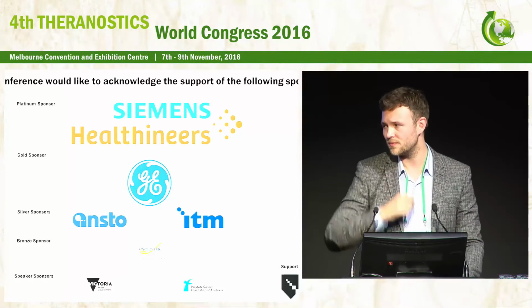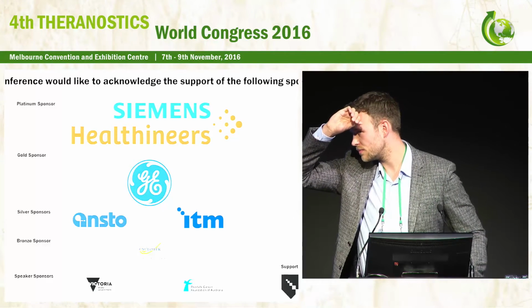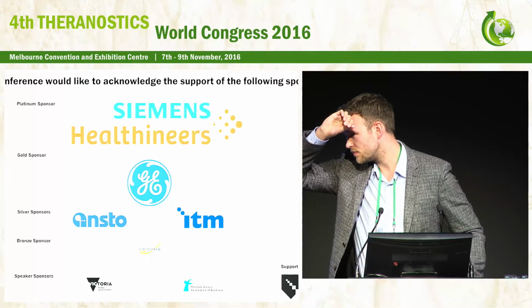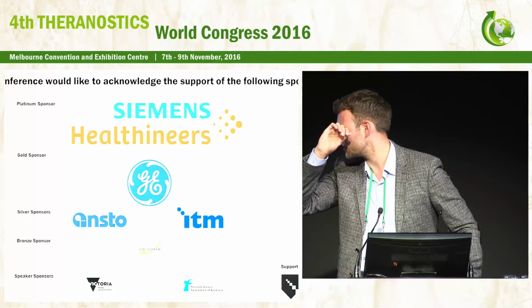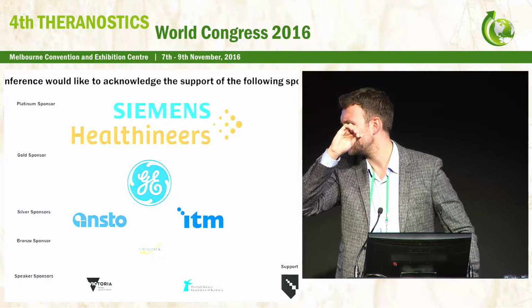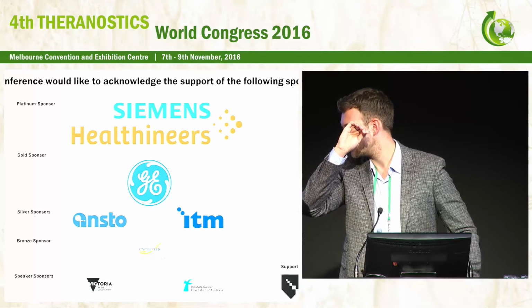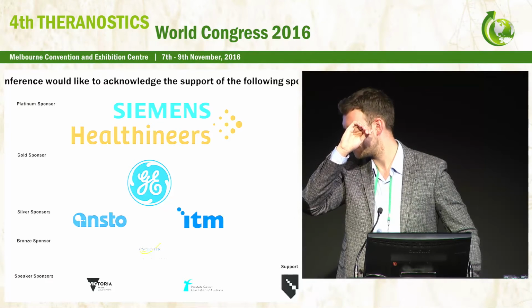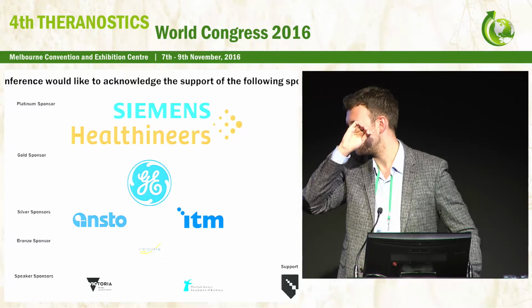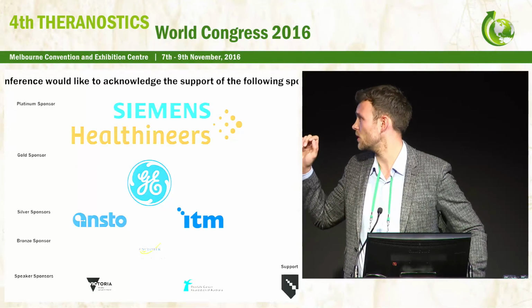Thank you. Question over here? Just a short question. Did you consider the speciation of the gallium in the presence of chloride, due to the formation of gallium chlorocomplexes as a function of pH? Sorry? So in the presence of chloride ion, there is a formation of gallium chlorocomplexes. Yeah, sure. And the speciation of the gallium as a function of the pH, in the presence of constant chloride concentration, depends on the pH, of course, and the hydrolysis of the gallium. Did you consider this type of speciation during your separation? On the TLC method? Yes. And also in the HPLC.